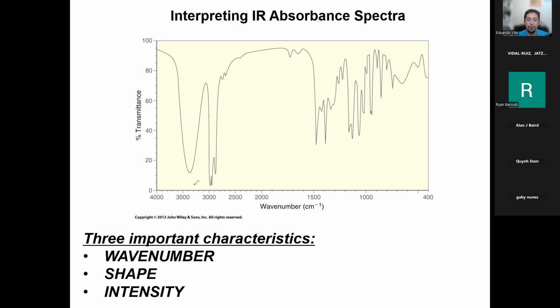So this would be a strong or very strong peak. We usually say VS, very strong, or we just write it out. These are also very strong peaks. It's below 20% transmission, almost 10% for some of them. This one's at about 3%. This is definitely a very strong, sharp peak. You'll also notice that all of these peaks kind of blend together up here. So the signal is broad, but the peaks themselves are sharp. This is just semantics, linguistics.